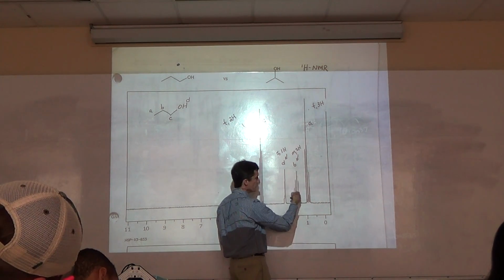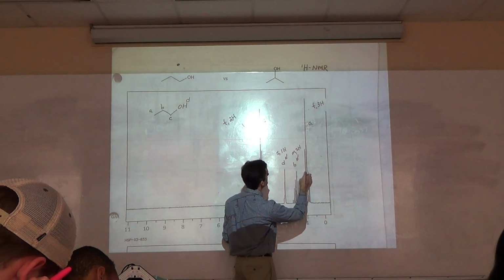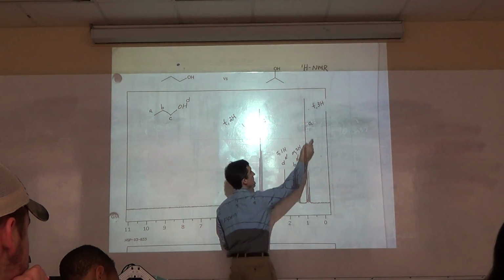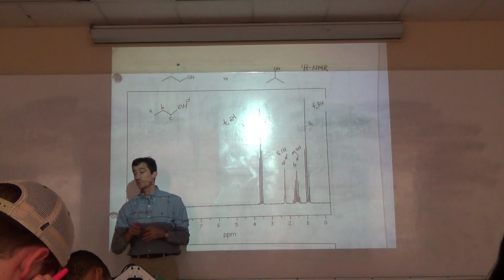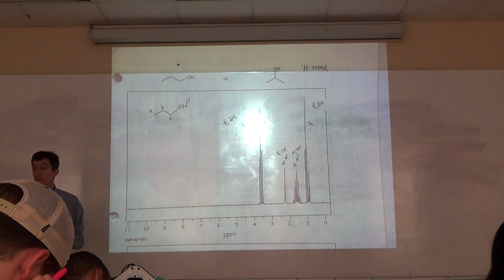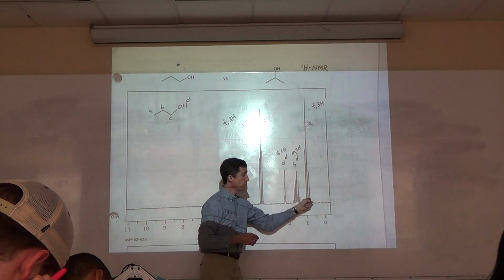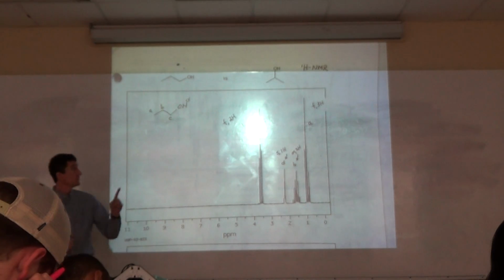This is a multiplet because it's many lines. And this is a 1, 2, 3, what is that? Just like this, that's a triplet, T. So our signals will have different, what's called multiplicities, or different line splitting. But that is 4 signals, because we have 4 different types of hydrogen.